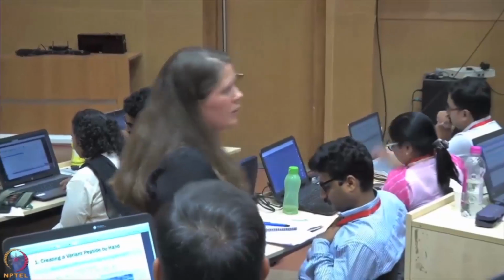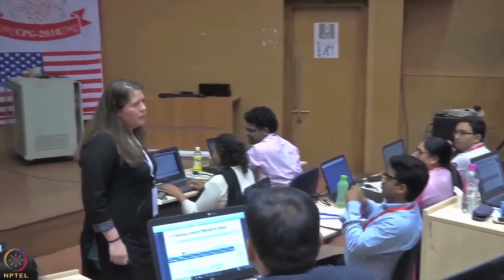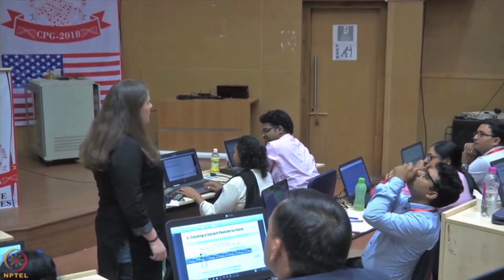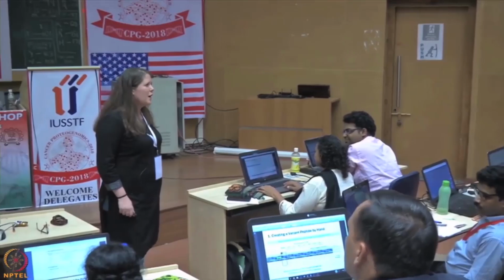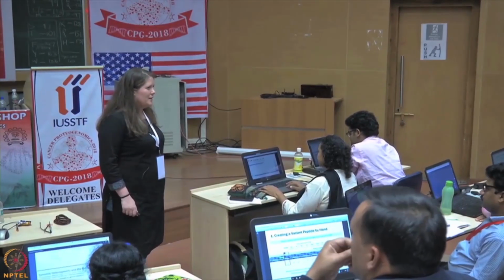Say that again? Can the variant information only be given in VCF file format, or in any other file format also, in this tool you are talking about? So you're asking whether you can use a different input format? You may be able to use other files, but I haven't tried. What kind of file format were you thinking?